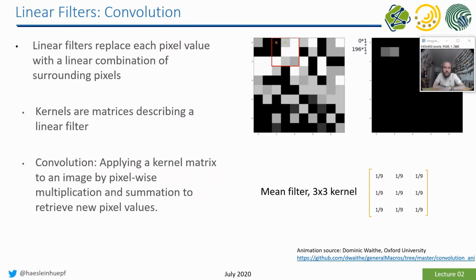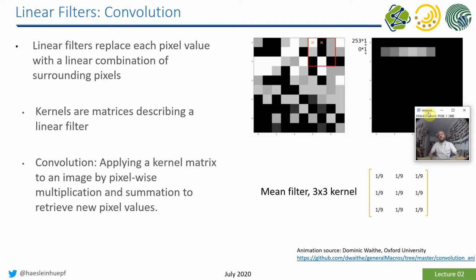When you think about how filters are applied, applying a filter to an image is basically moving a region of interest, or a window of some pixels, over our original image and measuring, for example, the intensity of these 9 pixels, multiplying these 9 pixels with these 9 factors over here, and then taking the result and writing it in a new image.